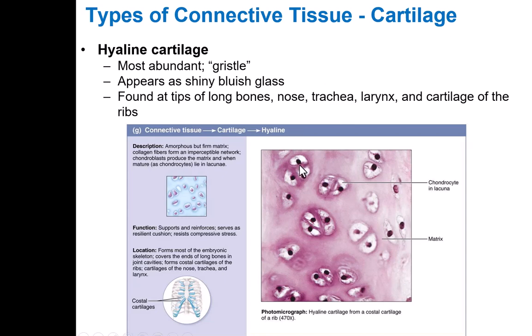Those are nuclei, so you know there are cells here. You see there's background. Okay, so you know it's not epithelial tissue. It must be a connective tissue. And you see what appears to be that you have a nucleus, and so you see this border around the nucleus. You might jump to conclusions and say, well, that's just the cell membrane for that cell, but it's not. The cell membranes don't often stain very clearly when you're looking at tissues. So when you see a cell nucleus, know that that membrane is there, but often not very visible.